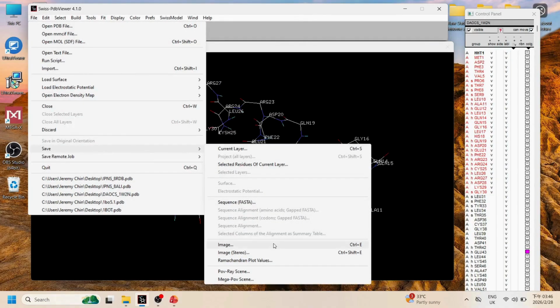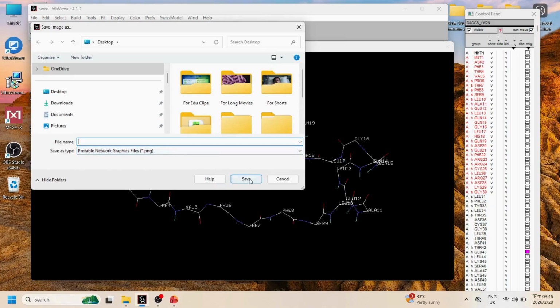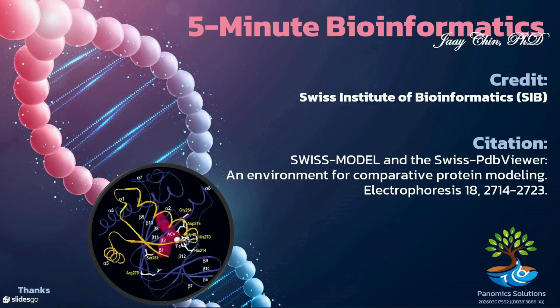By the end of these 3 tutorials, you will be able to manipulate and visualize protein or peptide structures to suit your needs. Stay tuned for a few upcoming tutorials on more specialized and advanced techniques.